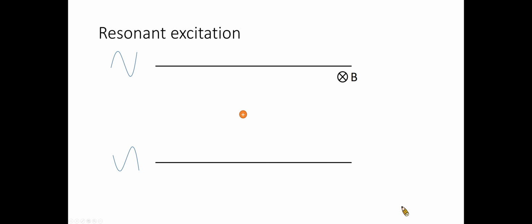When ions are initially formed or placed in a magnetic field, they are likely to both have relatively small cyclotron radii and be uniformly distributed around the central axis. Both of these characteristics make image current detection difficult, if not impossible.